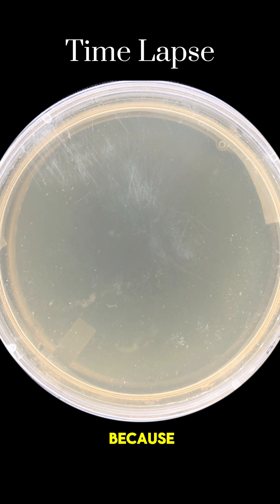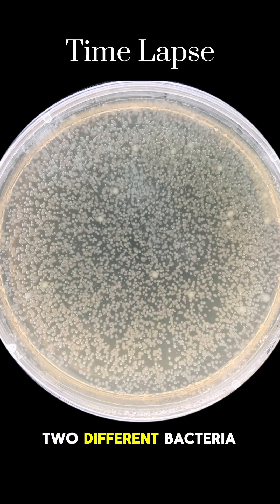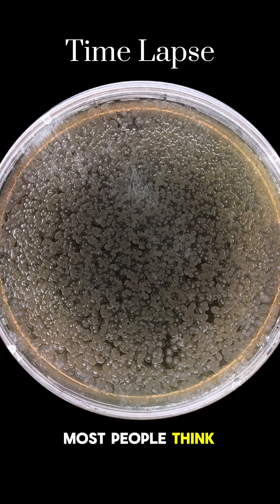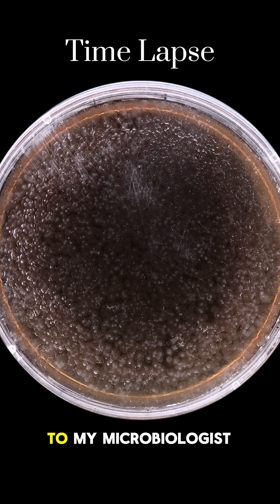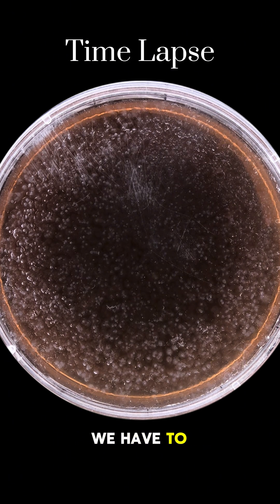You guys are in for a real treat because after almost 10 years of working with petri dishes I have never seen this happen. I can tell that there are two different bacteria species growing on this plate and whatever they're doing they're turning this petri dish black. What's interesting is most people think bacteria has a bad smell, but this bacteria actually had a very sweet smell — and that should be a pretty big hint to what it is to my microbiologist friends. But regarding whether this is concerning or not, we have to look at another dilution.